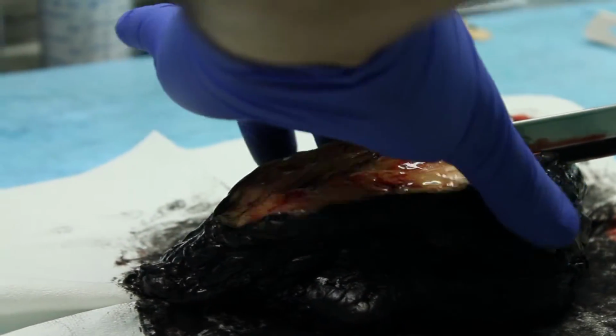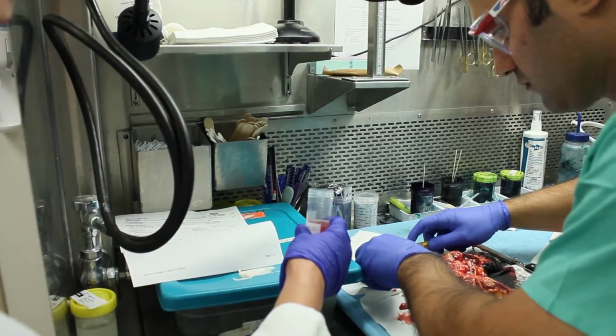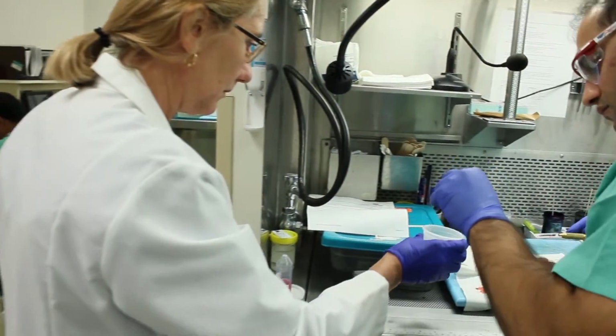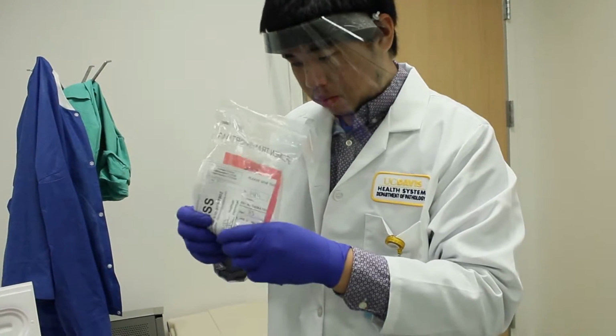At that point, we make a decision that there is adequate tissue that is able to be donated to the biorepository. So that process enables us actually to deliver fresh tissue to a researcher within perhaps an hour to 3 hours from it being inside the patient into their hands and for their research questions.